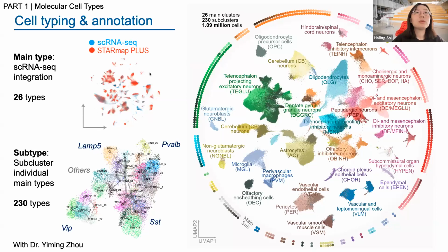Yeah. So what we did is we first cluster this joint embedding, and for each individual cluster, if the single cell RNA-seq label for this cluster has a purity over 90%, we think it's a successful integration and a clean cluster. In this case, we transfer the label of those blue cells to the red cells, the spatial cells we have in the same cluster. That's the criteria for cell label transfer.